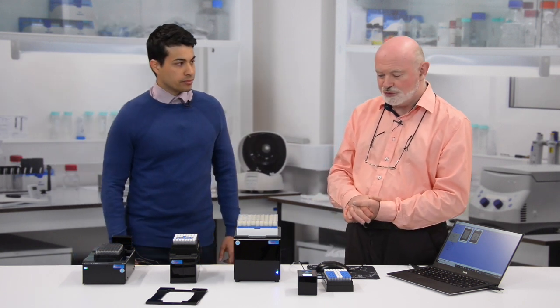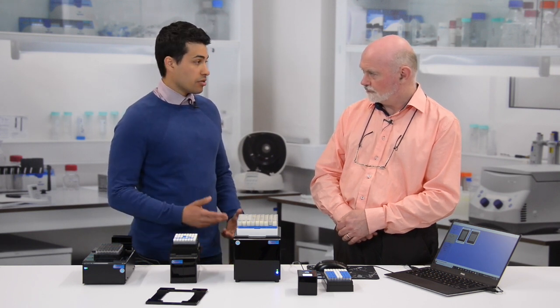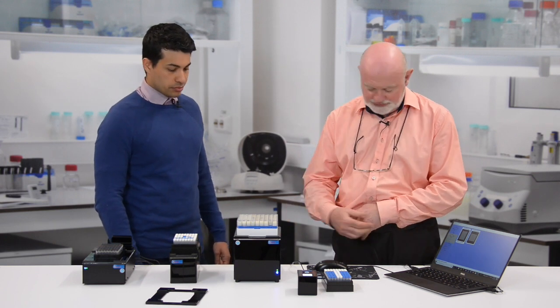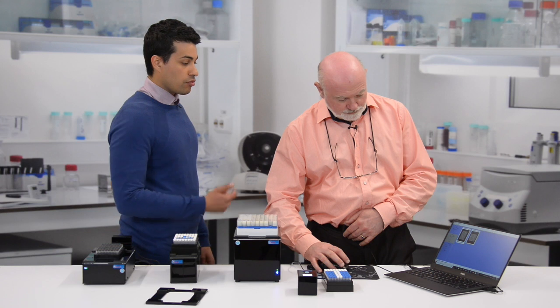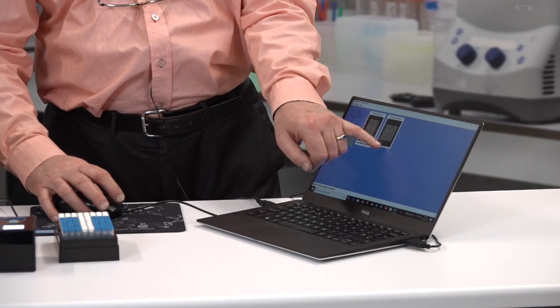Ziath scanners have a reputation for being easy to set up from the box. All of our scanners arrive pre-calibrated, so you can take them straight out of the box and run a scan as soon as you've installed the software. We have the software installed on this laptop, and you can see we've got the Cube selected. Anyone can walk up, click the required template they wish to scan — in this case, with the Cube, it's an 81-place cryo box.